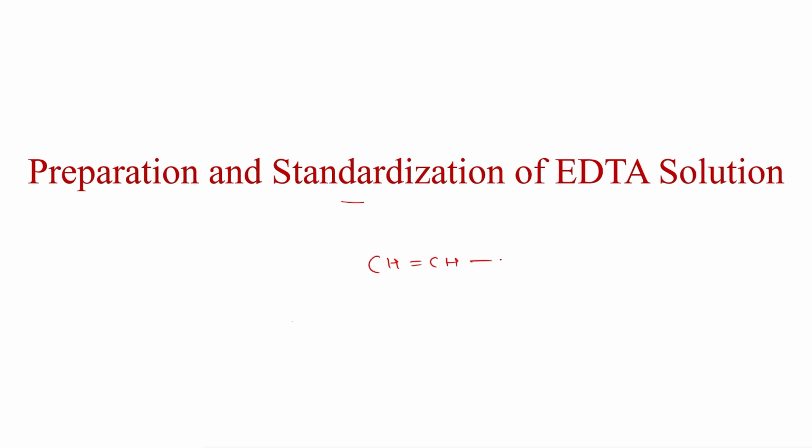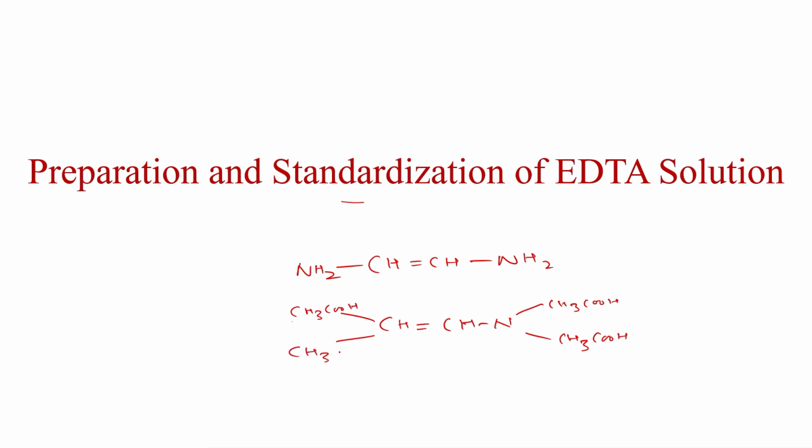So this is ethylene diamine, and tetraacetic acid. If you want to incorporate in this, so ethylene diamine tetraacetic acid.